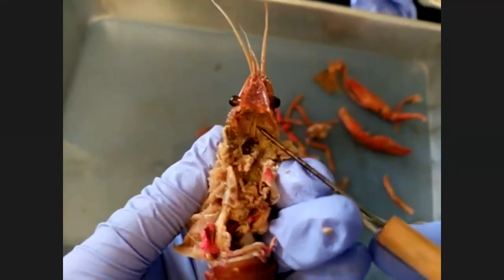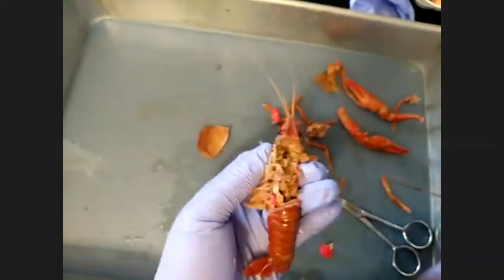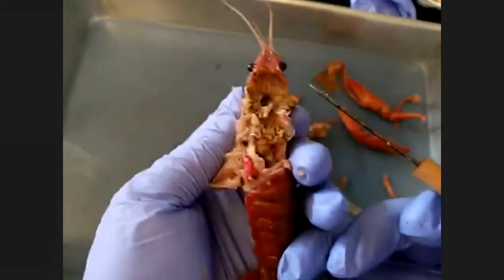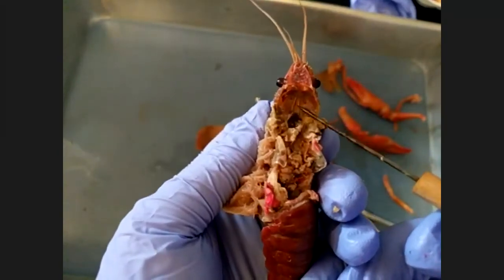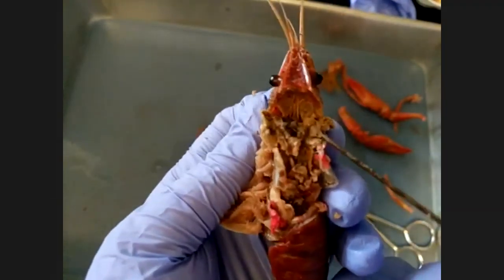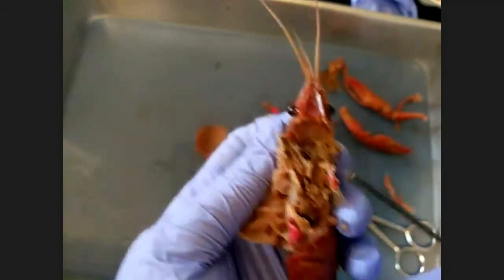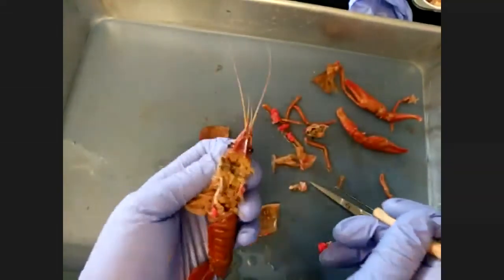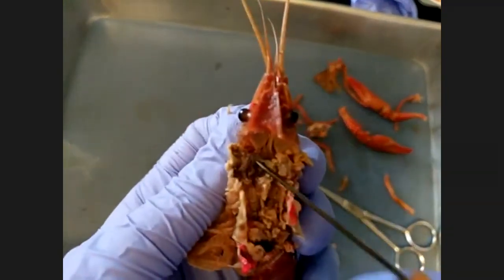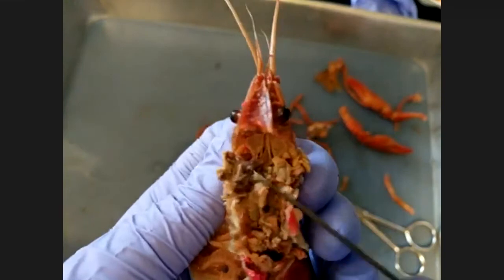Right in here, do you guys see those two little lines right there? Those two lines are the nerve cords that connect to the brain. Do you see how tiny that is for this thing? So those two little bitty lines are the nerve cords. All the rest of this, do you see how it's kind of fatty looking and white and crumbly? That white, crumbly, fatty looking stuff, those are all the digestive glands. So that's going to help it digest its food and produce those necessary digestive juices. Okay, gross. Sorry. It's like brown.